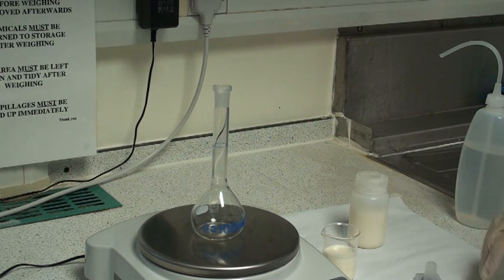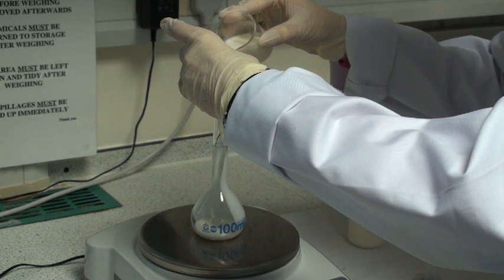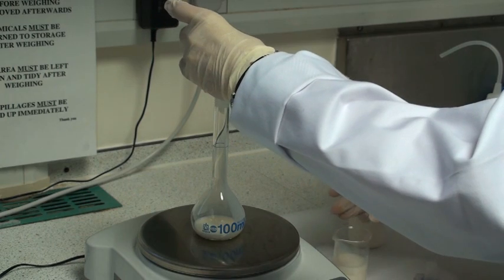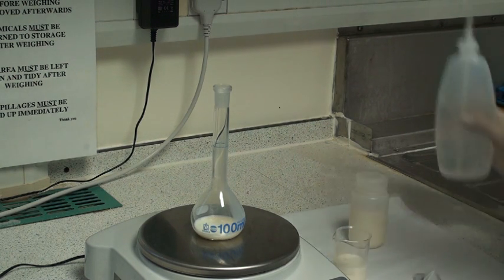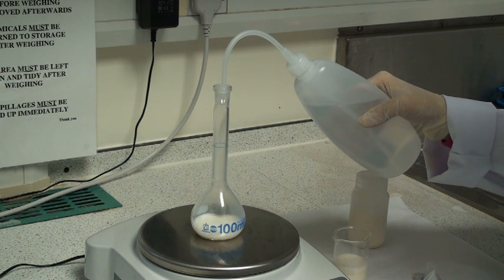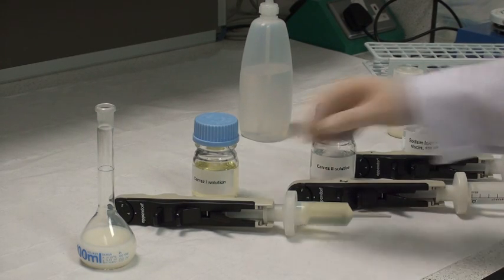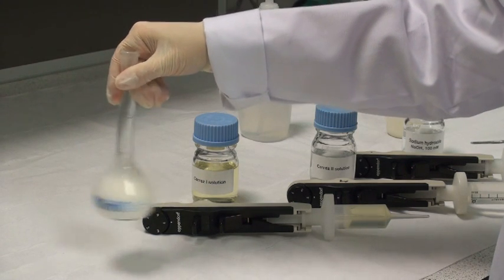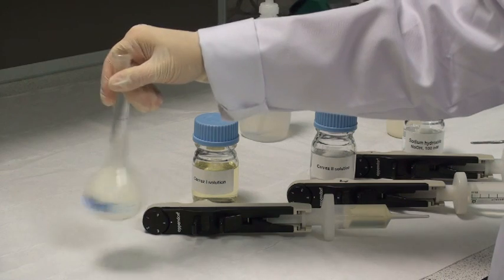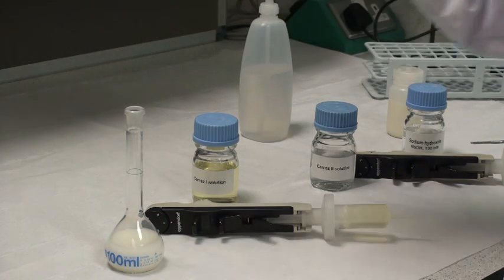Accurately weigh approximately 10g of milk into a 100 mL volumetric flask. Remove the filter funnel and record the exact weight. Then adjust the volume to approximately 60 mLs with distilled water. At this point, add 2 mLs of Carrez 1 solution to the volumetric flask and mix the contents thoroughly by vigorous rotation.